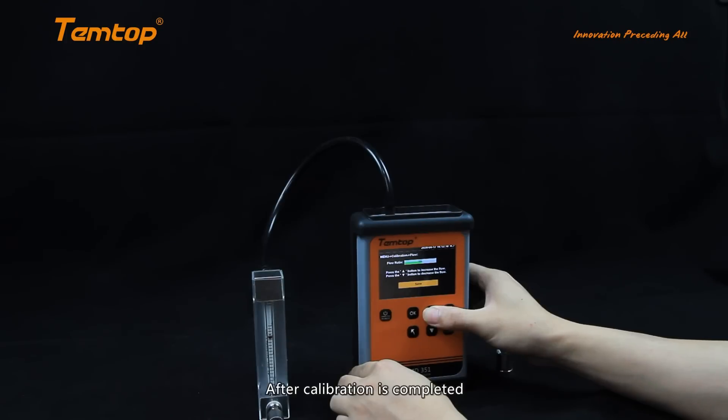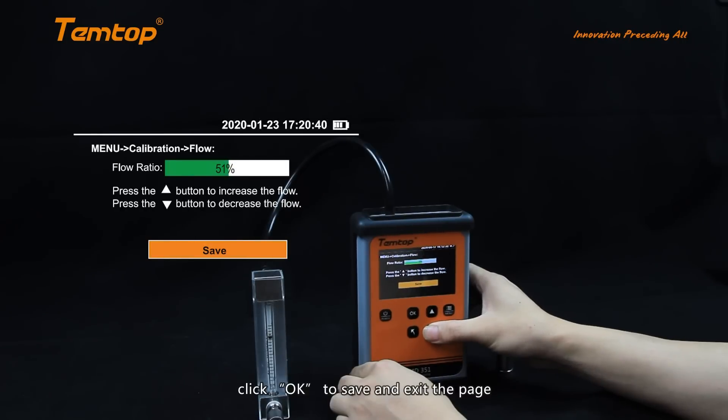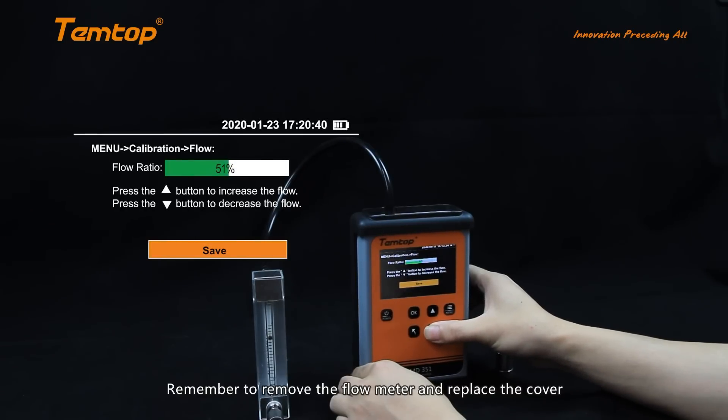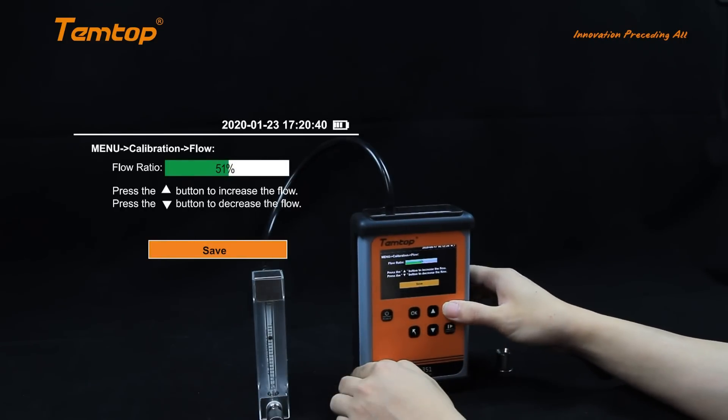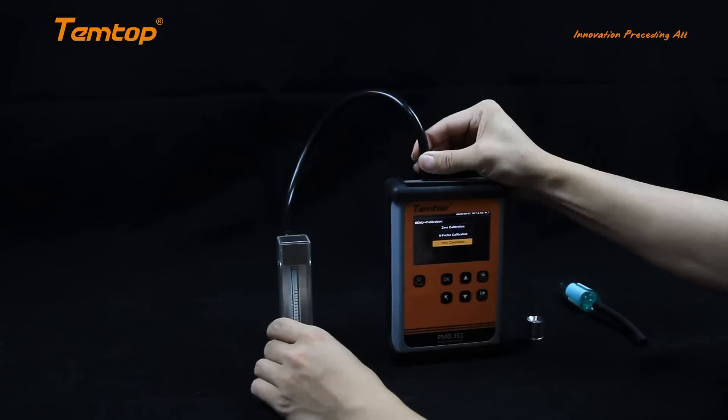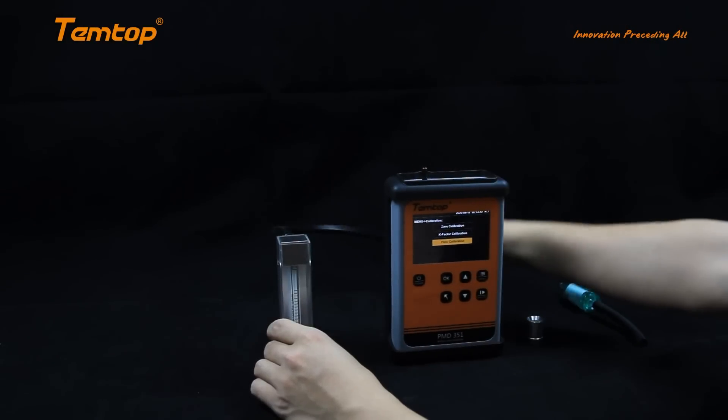Click Up and Down to adjust the value until the flow meter indicates 2.83 liters per minute. After calibration is completed, click OK to save and exit the page. Remember to remove the flow meter and replace the cover.